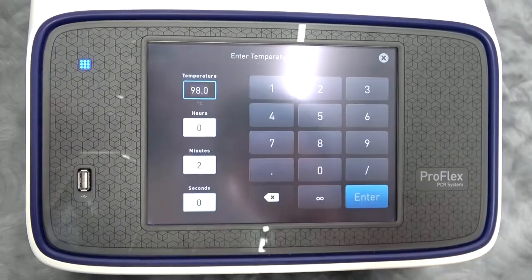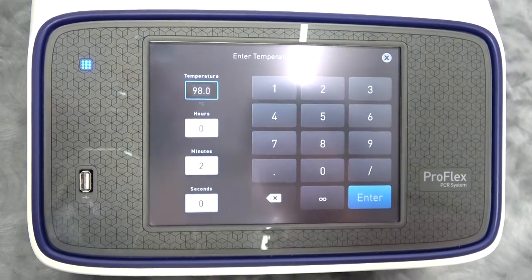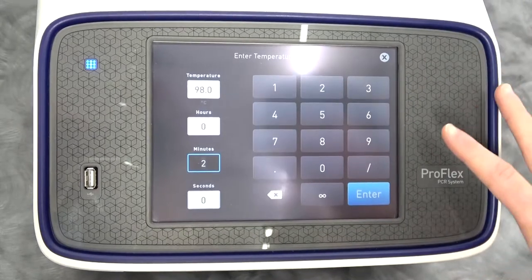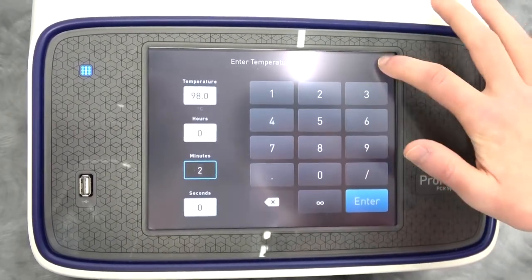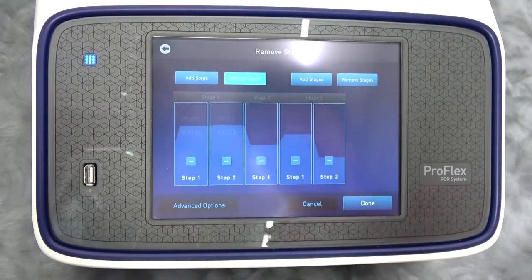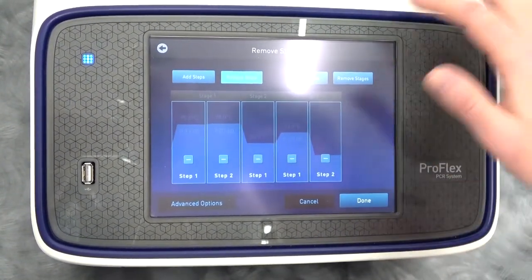This is really, really easy to use. This is not a clunky GeneAmp 9700 — I've never used a GeneAmp 9700, so maybe you like those. Some people find touch screens that don't feel good, but this is super easy to use. Here's where you can remove entire steps from your process and just have a big old time customizing your run.